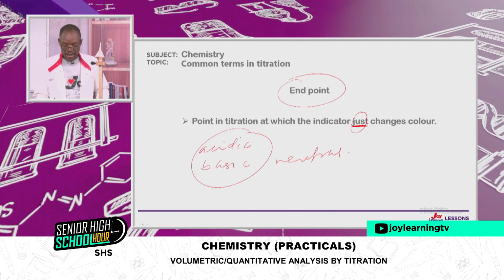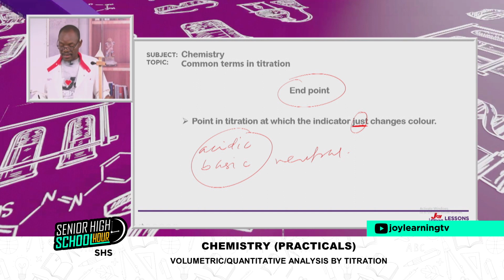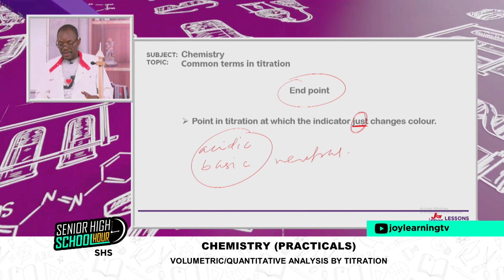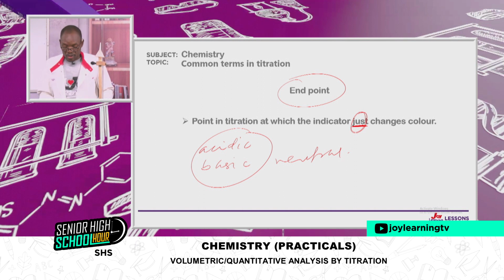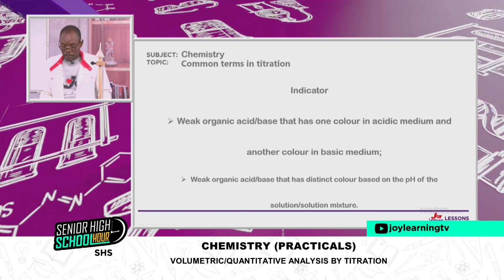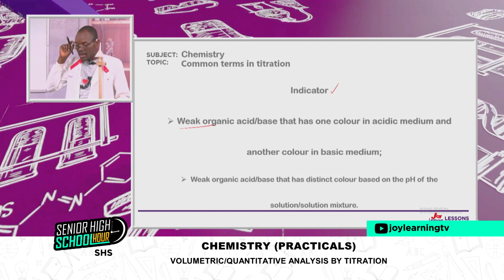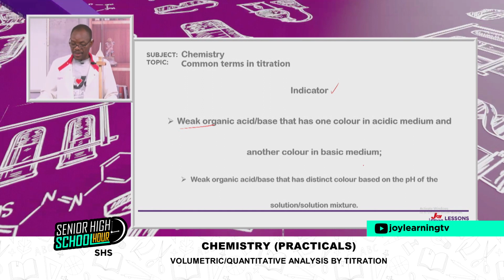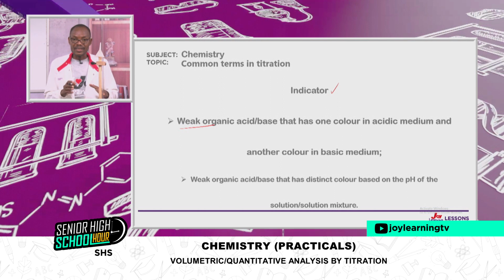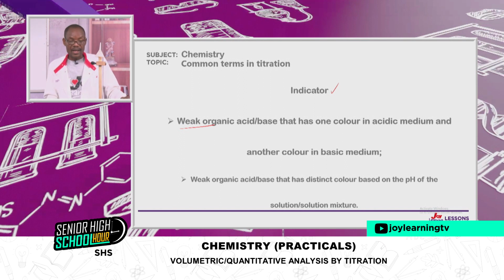But at our level here, we are just practicing to obtain the necessary skills. So we use the indicator to just indicate that the reaction between an acid and a base in acid-base titration is complete. So the indicator changes color and then you stop the titration and read your values. The indicator is a weak organic acid or base that has one color in acidic medium and another color in basic medium. So that reinforces the fact that the color changes will be slightly basic or slightly acidic to see a color change. Otherwise, the color will not change.